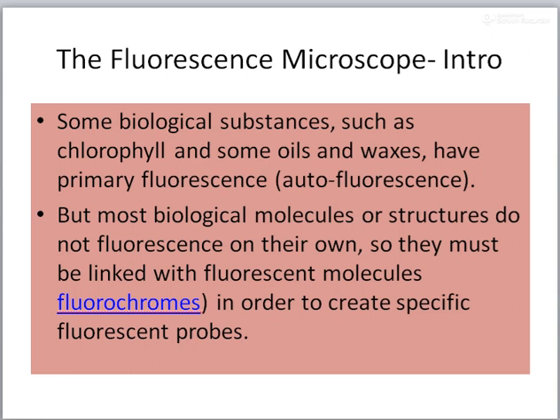Now you might wonder, what is the property of fluorescence? When some substances are being exposed to a particular beam of light, they will absorb that light and they get what? Excited, and they will emit another frequency of light which will help us to detect them. I'll give you a simple example. You might have already noticed in the watches as well as in the stickers which we use, of the sun and moon and all that, which we stick on the walls for children to play.